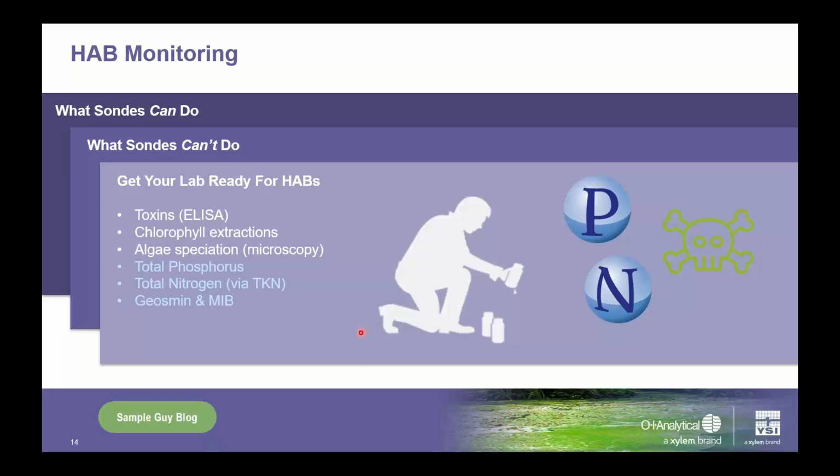And so if you want to have a very robust harmful algal bloom monitoring program, you really have to balance field measurements with measurements in the lab. And in reality, most measurements still are done in the lab.